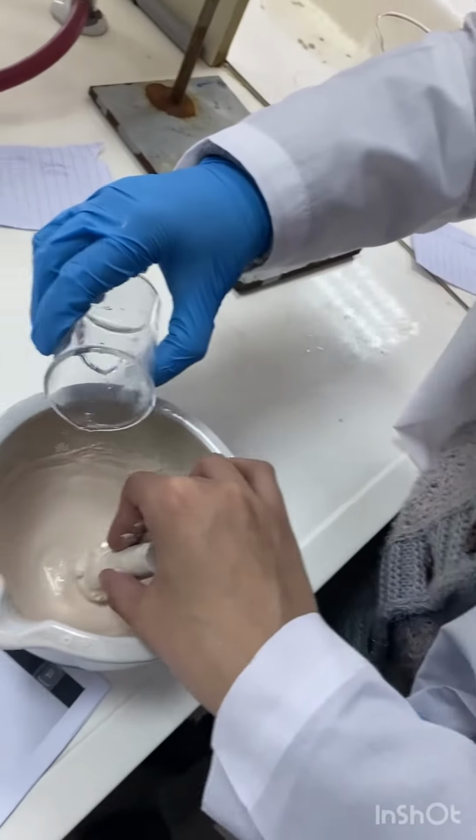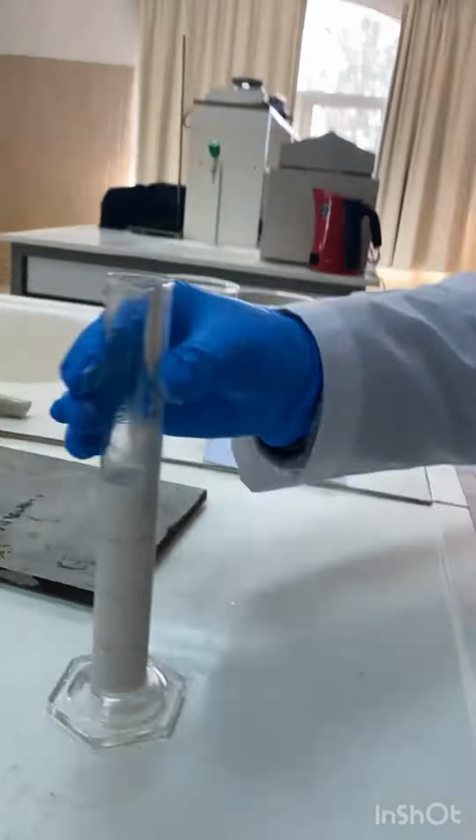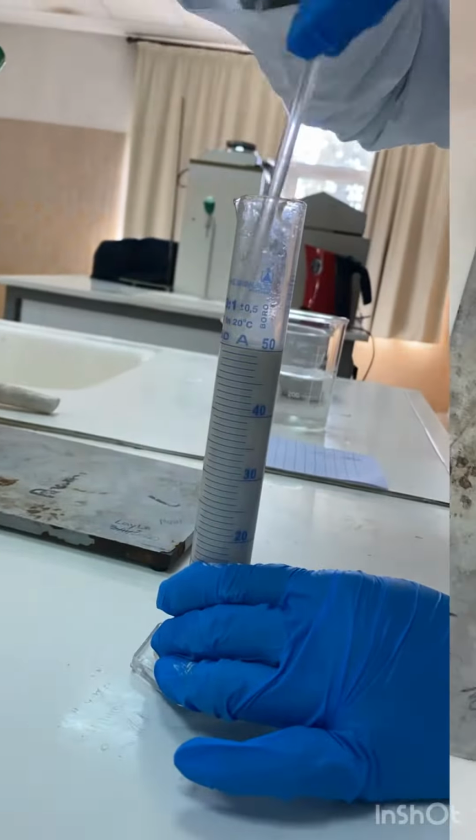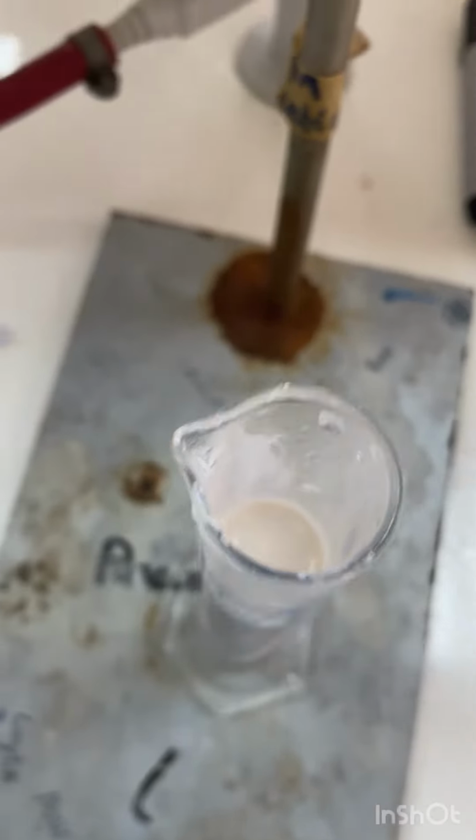Now add the glycerin to obtain this texture and add your obtained mixture into the graduated cylinder. And continue adding your vehicle up to the line mark, which is water in our case, to obtain your calamine lotion. Finally, be alert to shake it well before use.